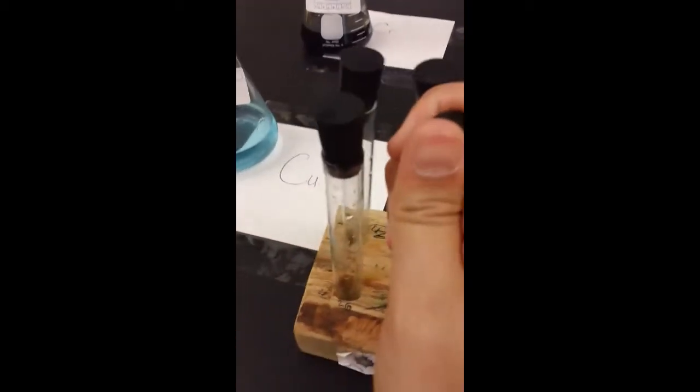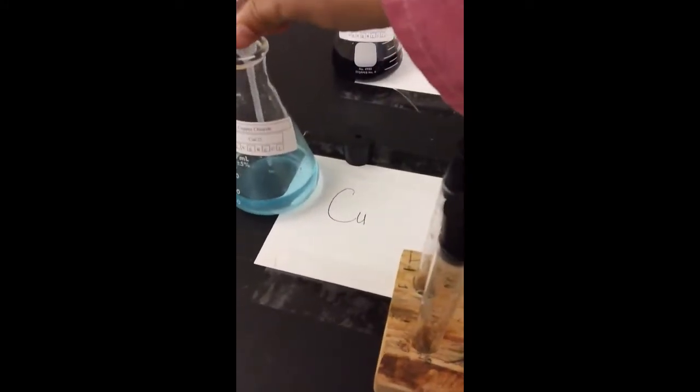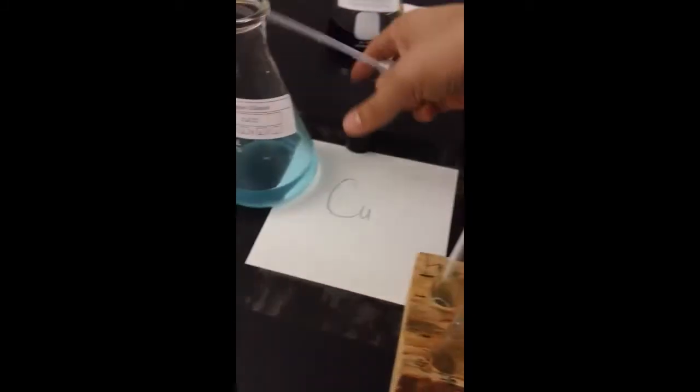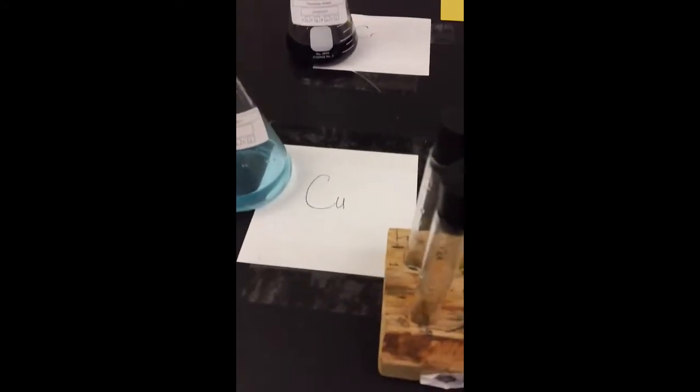On the other side of my block, I know it's a little bit hard to see, but this one here is Cu. So this test tube is going to be Cu, or copper. And that leaves my last one over here to be K. My last one is K, and that's potassium. And these are ionic solutions that we're working with here.